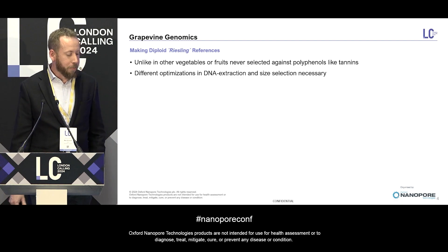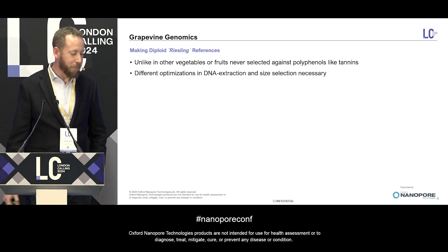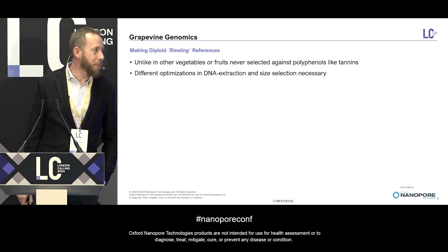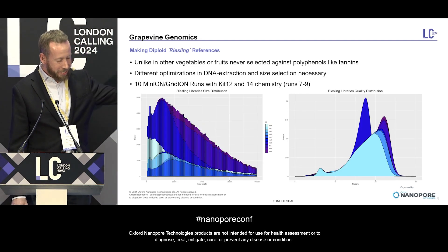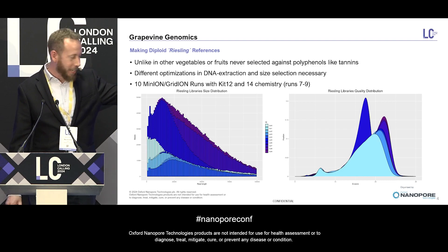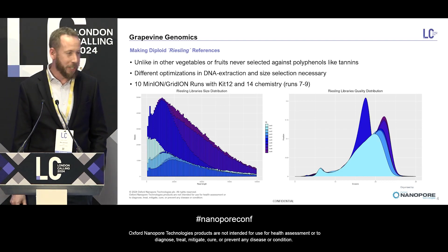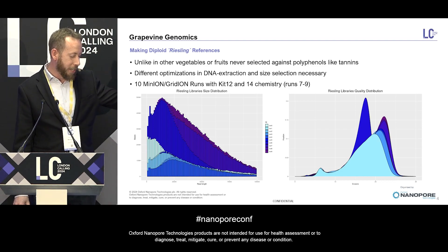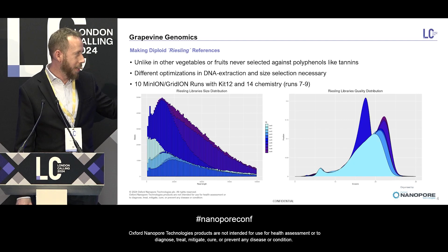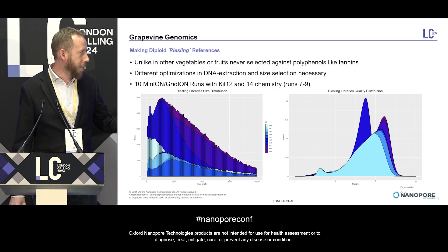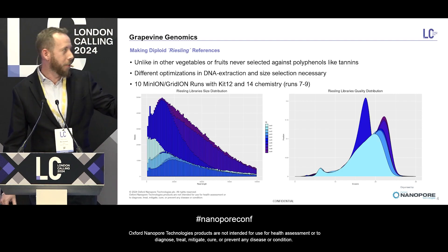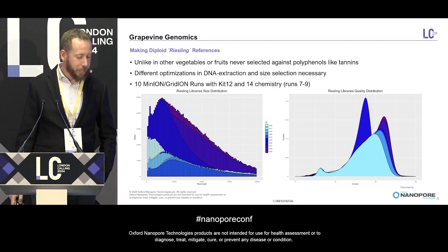So we had to do some optimizations to our DNA extractions. As Captain Jack Sparrow said, complications arose, endured, were overcome. Eventually we got there. You can see continuous progress — we started with kit 12, the lighter ones are earlier and the darker ones are later. We got better on yield, and especially on error rate. You can see the Q-score has continuously been shifting to the right.